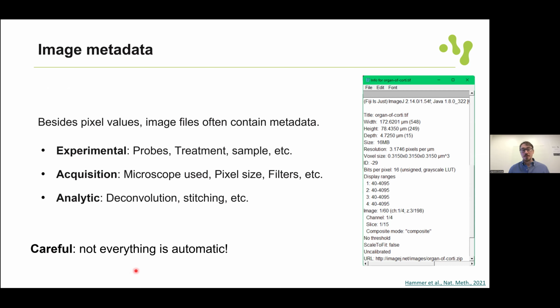But be careful, because not everything is automatic. Not all the metadata is saved by default. So it requires someone to configure your microscope. They're usually configured, so remember that there are people working on this. But if you get a microscope in your lab that nobody has worked on, it might not have all these things configured.